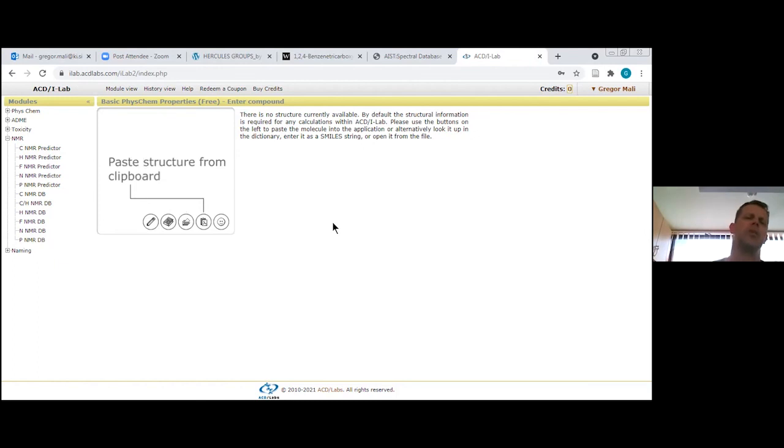Of course, such databases include only organic substances. When you go to inorganic things, crystals, you don't have databases, but then you have literature, right? You look for similar literature, and perhaps you learn that, I don't know, as we were... I will stop sharing this and share DMFit again if I find it. Oops, here.